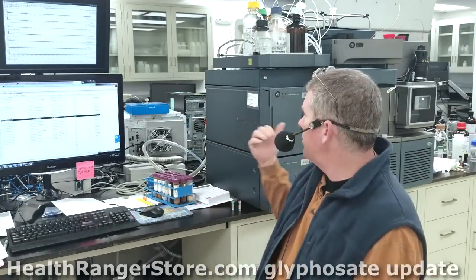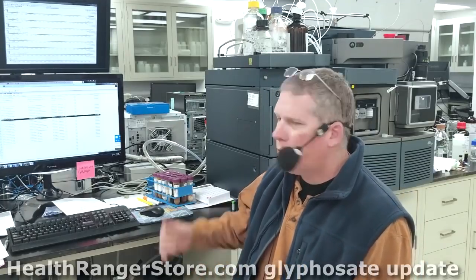Now, from a scientific perspective, it's important to have a discussion about what it means to be non-detected. Because this instrument is super sensitive, the most sensitive triple quad that you can buy on the planet today. It's top of the line. That's why it's $500,000. And it requires a tremendous amount of time and effort to learn how to use, and you have to supply nitrogen gas and argon gas, and of course all the right chemistry and chromatography in order to use it effectively.